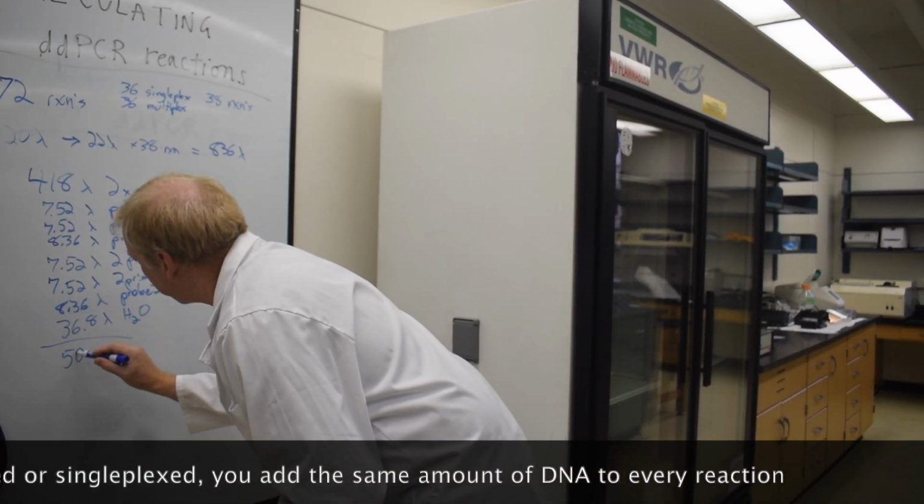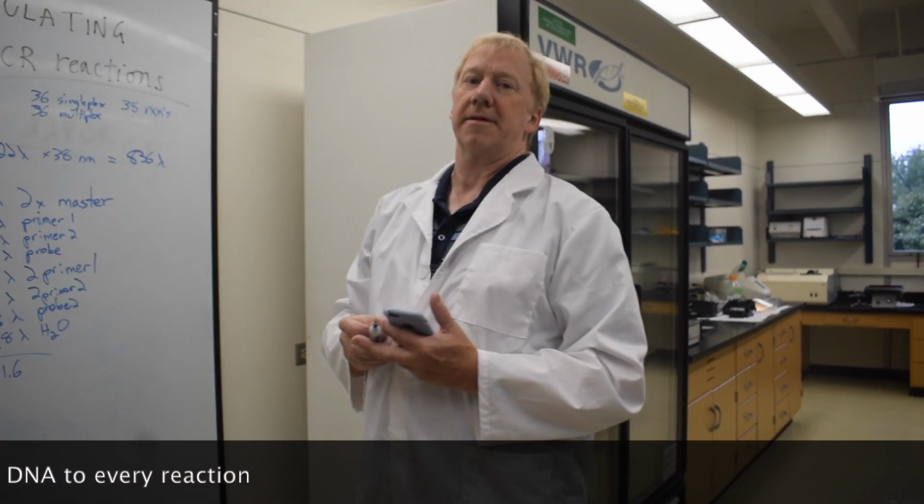And then you would add the same amount of template DNA to every single reaction, right? That is correct.